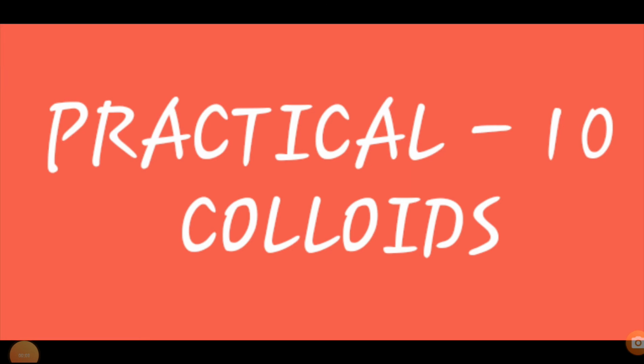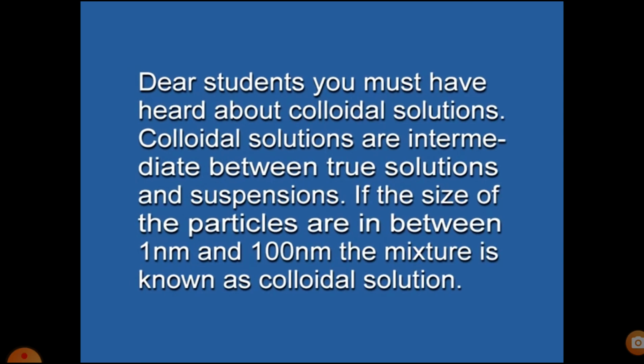Now we will start practical number 10, colloids. Dear students, you must have heard about colloidal solutions. Colloidal solutions are intermediate between true solutions and suspensions. If the size of the particles is between 1 nm and 100 nm, the mixture is known as a colloidal solution.